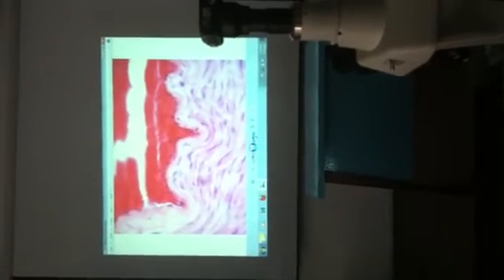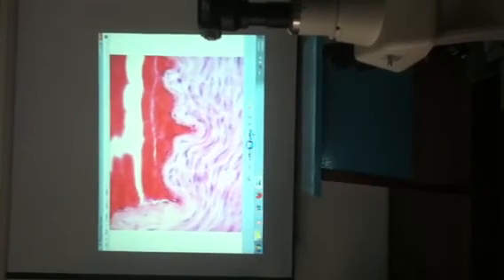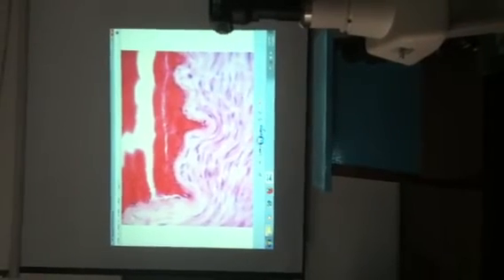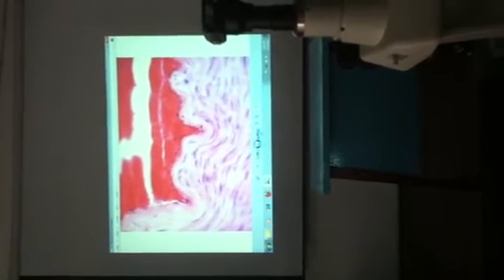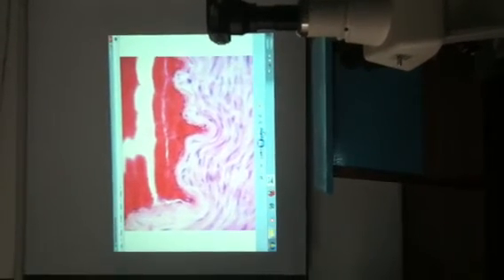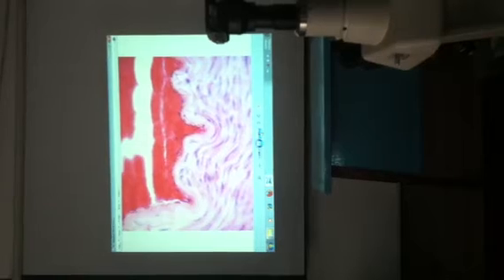In serous spaces, serous cavities, it is called mesothelium. So for example, in the peritoneum, in the pleura, it is a mesothelium. So under high power objective, ito lang ang simple squamous epithelium, specifically called endothelium.